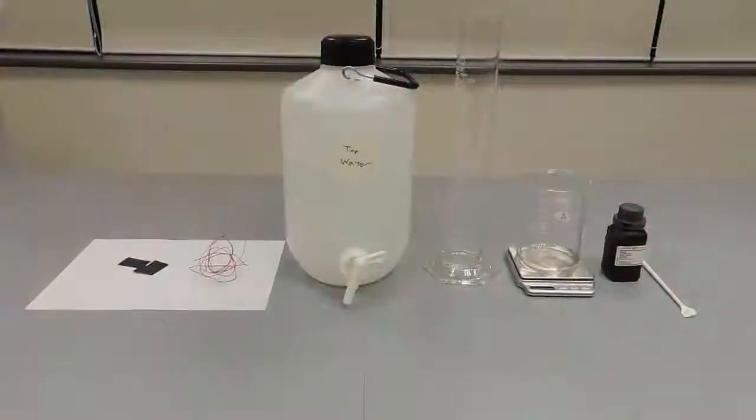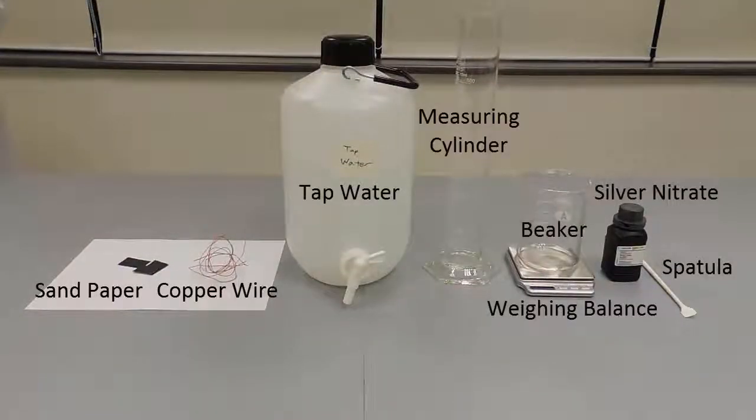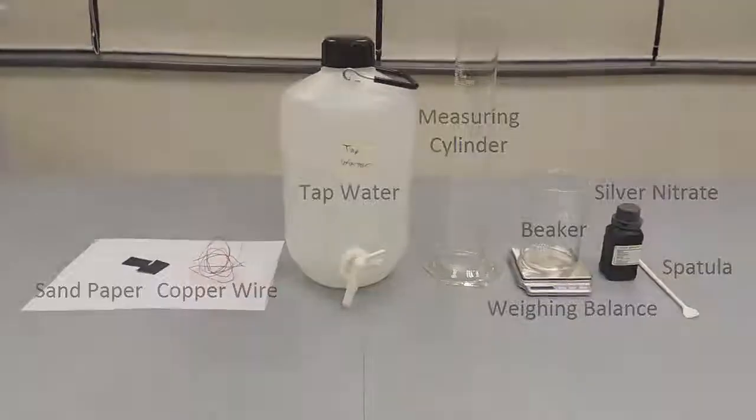The materials and apparatuses used in this experiment are sandpaper, copper wire, tap water, measuring cylinder, beaker, weighing balance, silver nitrate, spatula, and 0.1 molar silver nitrate solution, which is made by dissolving silver nitrate in tap water.